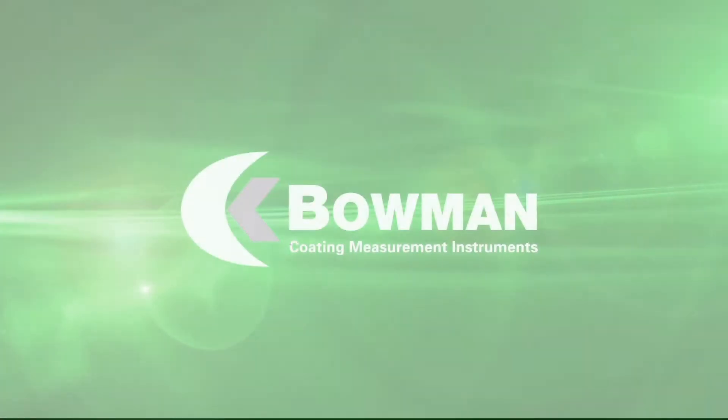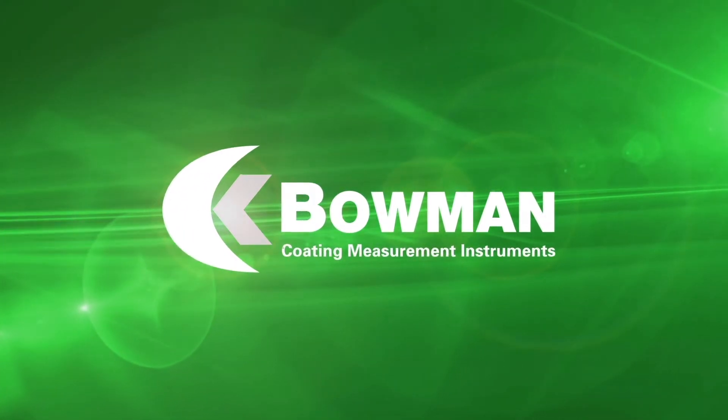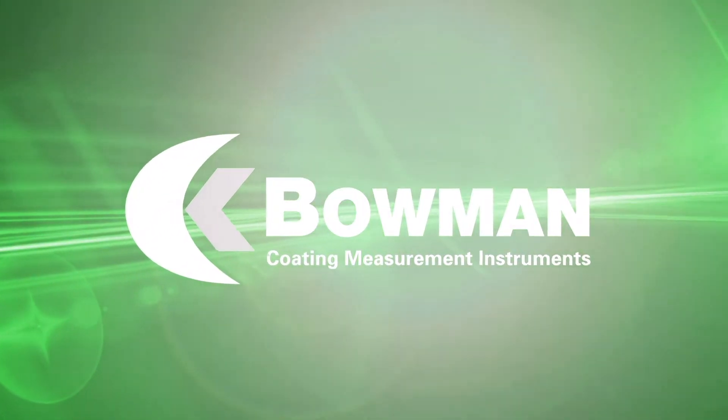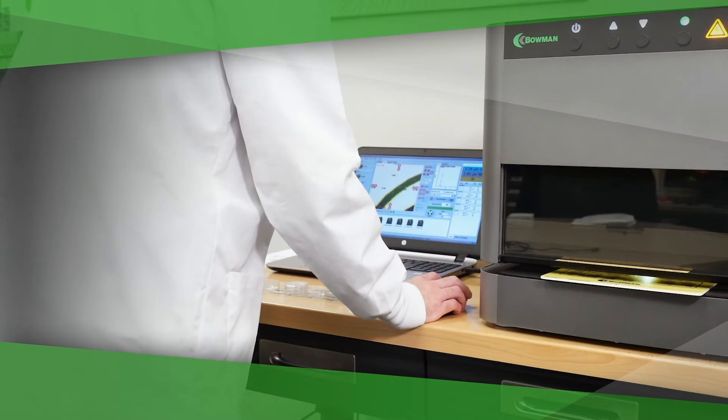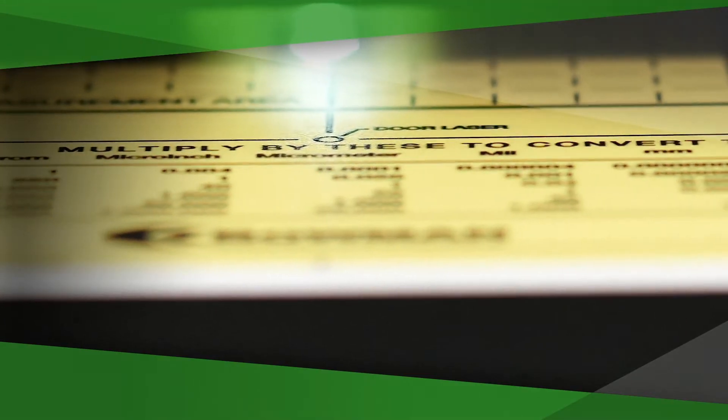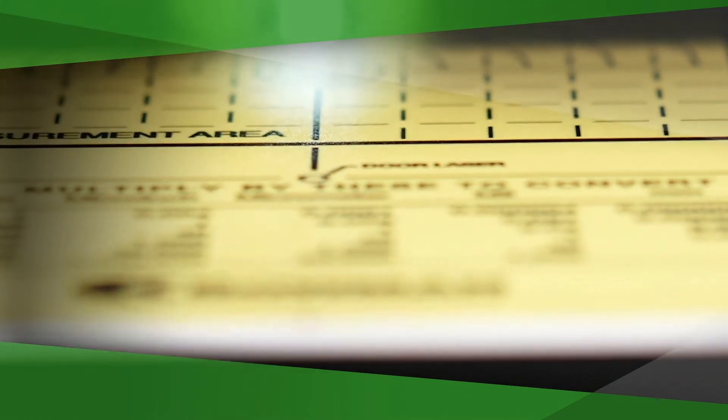Bowman is the premier manufacturer of world-class American-made XRF coating measurement instruments. Bowman XRF instruments use x-ray fluorescence to precisely determine the thickness and composition of plating deposits with exceptional accuracy.